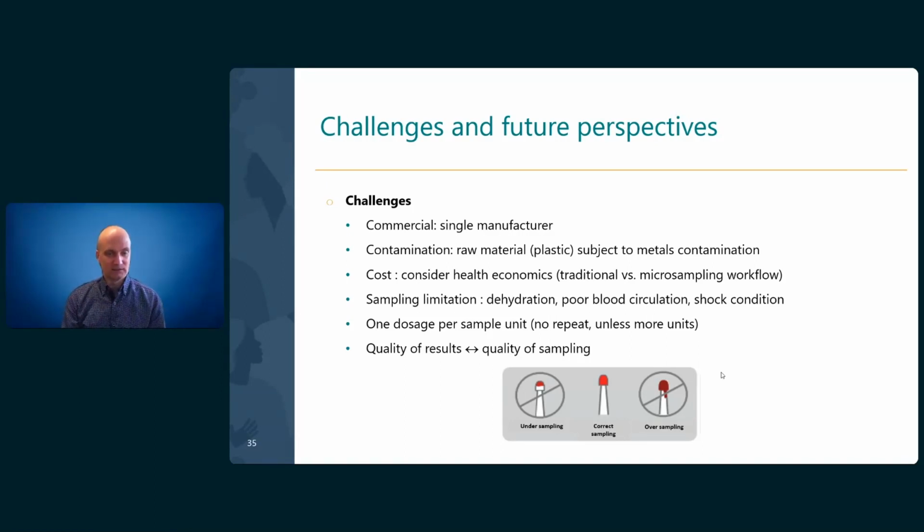Finally, it's worth mentioning that the quality of the results will strongly depend on the quality of the sampling. This is true for all types of sampling, obviously, but especially here with Mitra VAMS devices. So you have to make sure that you do a correct sampling.